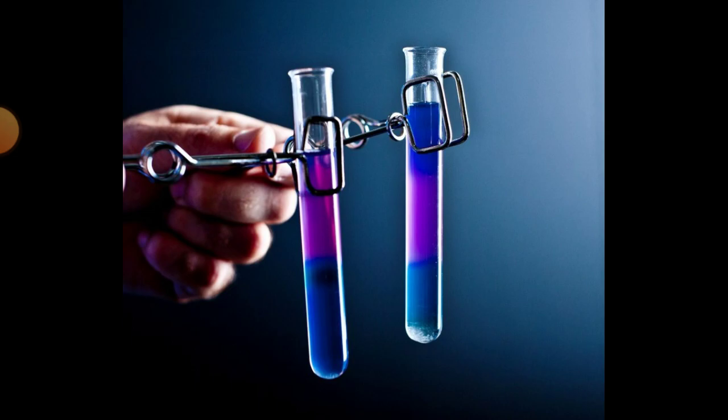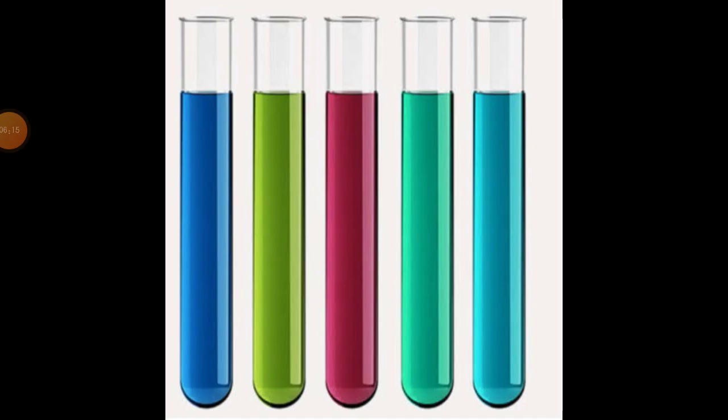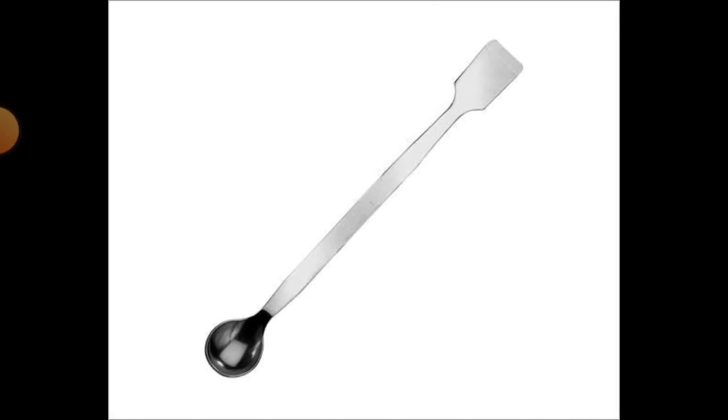I talked about the test tube. This is just those small, tiny vertical tubes that you see in the lab for tests. This is an example. I brought it out for you so that you will see exactly what we are talking about. Okay? This is another example. You just pour your solutions, those solutions I mentioned, like tetraoxosulfate 6 and hydrochloric acid and all the rest, into these test tubes.